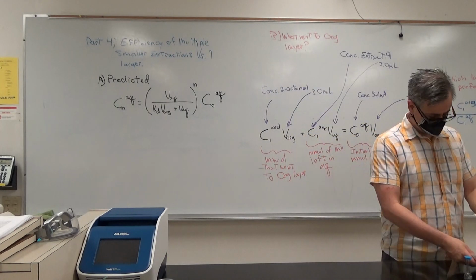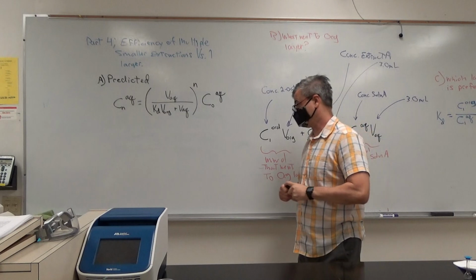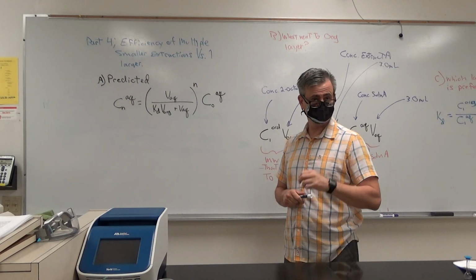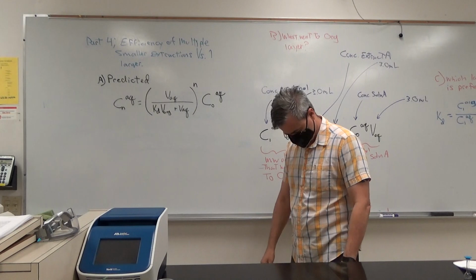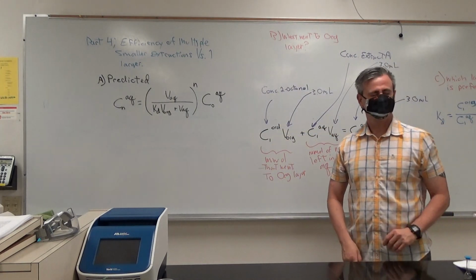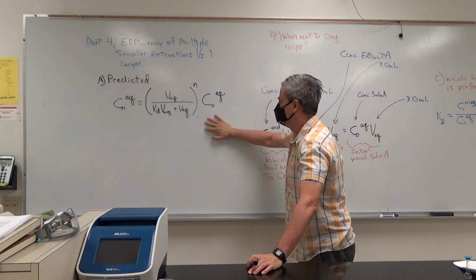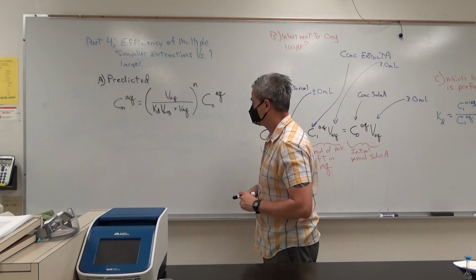All right, so, like I said, if you know the KD, you can come up with a theoretical value for just that first extraction you did in part 3. Well, that sucks. Okay, I don't need it. I'm okay. Damn, there it is.